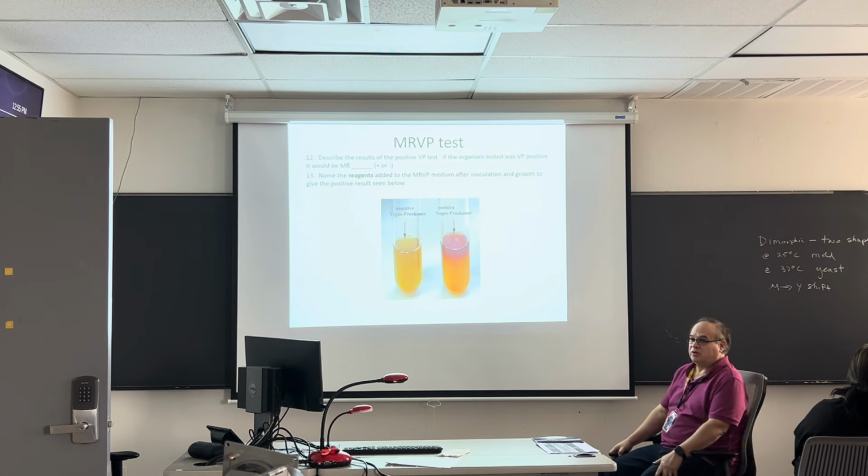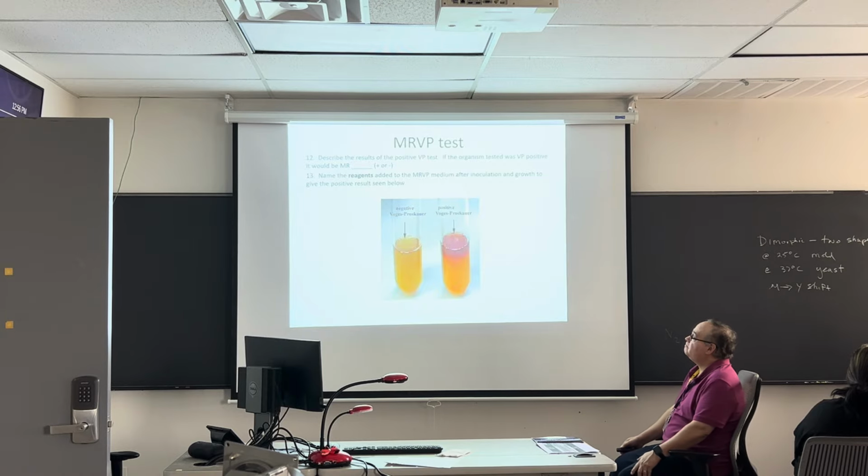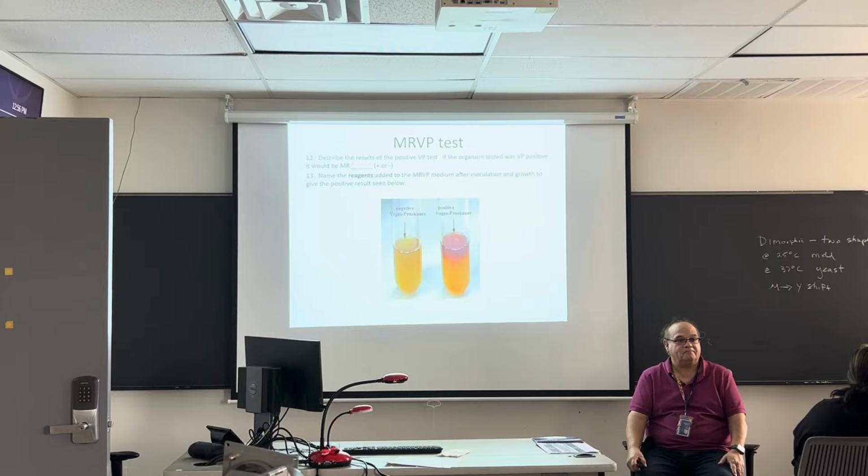What reagents are added to the VP test? Potassium hydroxide and naphthol. And what is a catalyst? Creatine. Good. Anybody have any questions about the MR or the VP?